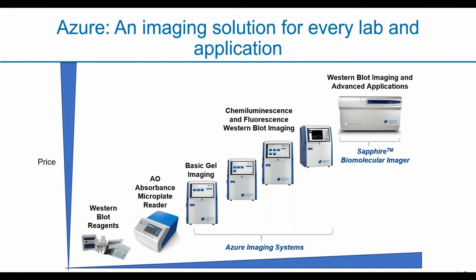So yes, that's one of the limitations of using this. You need to see whether it's compatible with your current equipment or not.